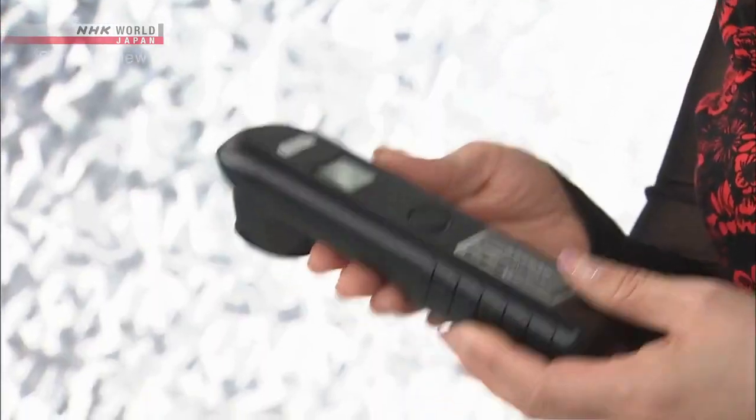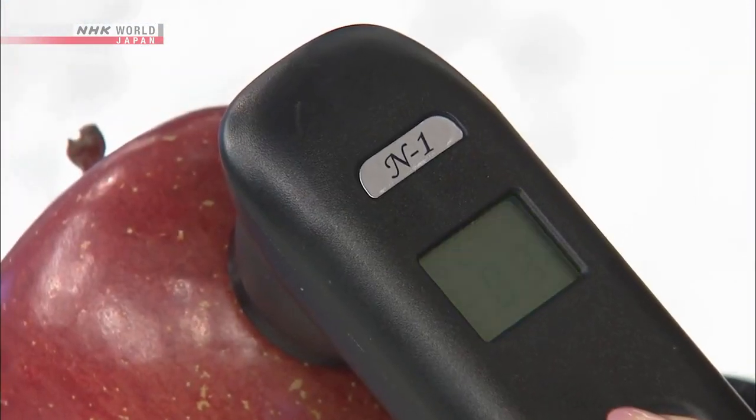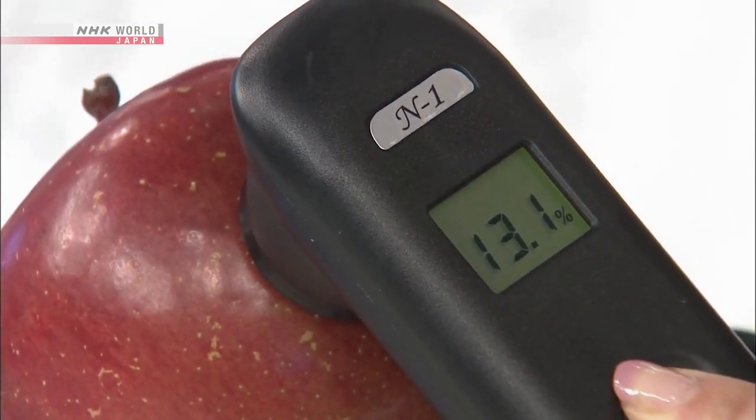Now the Takumi would like to look at other aspects of agriculture besides saccharometers and develop devices that would really help farmers and make their jobs easier. This is the new saccharimeter — very compact and light. Let's see if we can measure the sugar content of this apple. Just press the button in the middle for a few seconds. The sugar content of this apple is 13.1. That was very easy. This saccharometer is often used by individual farmers who sell their fruits directly to consumers. Demand for the device is particularly high among younger farmers who want to open their own sales channels by mail order and the internet. Even though the Takumi examined the conventional approach and developed a new easy-to-use device, he surely faced a different kind of struggle in mass producing his saccharimeter.